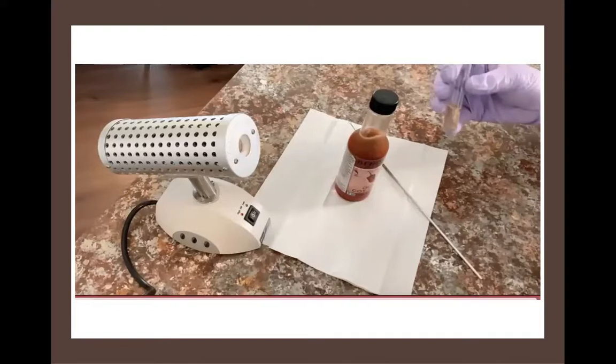So the test tube that I'm holding in my hand has a liquid broth in it, a nutrient media, and bacterial cells growing in it. And I'm going to take a sample of those cells out of this tube, and I'm going to flame the mouth of the tube before and after I remove those cells.